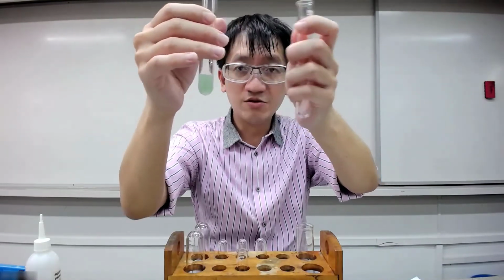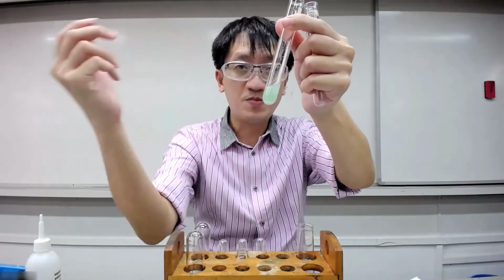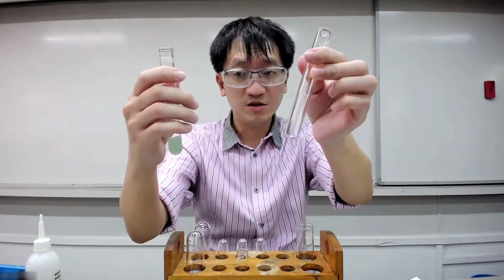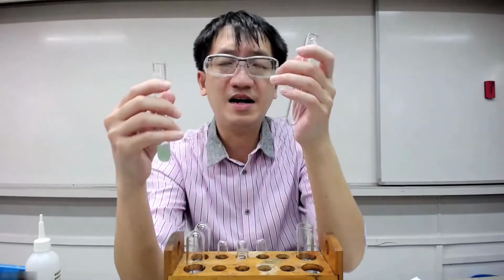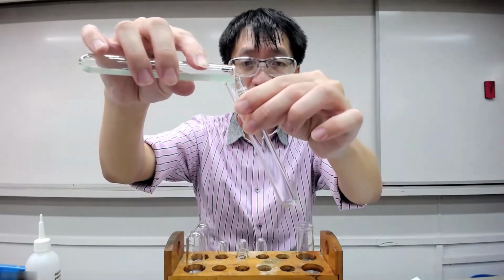So when you pour away, you do not need to pour until there is no PPT going into this empty test tube. Yeah, if some of it goes in, it's okay. So don't be OCD about it. Okay, so just pour. I just do a very quick pouring.